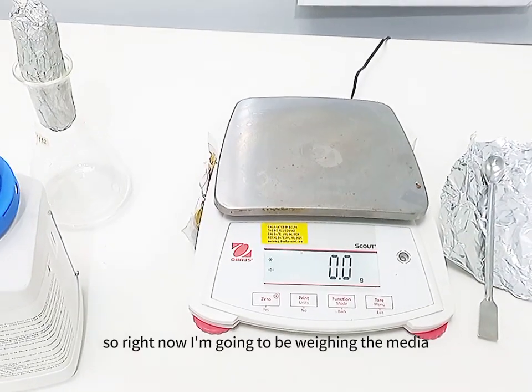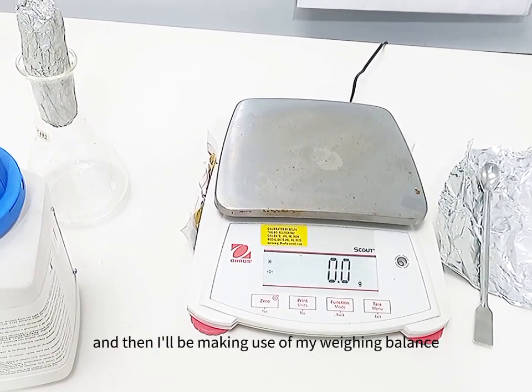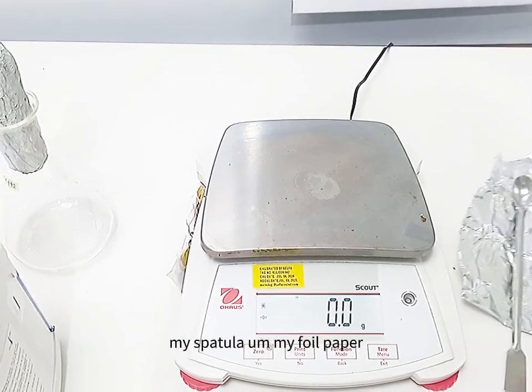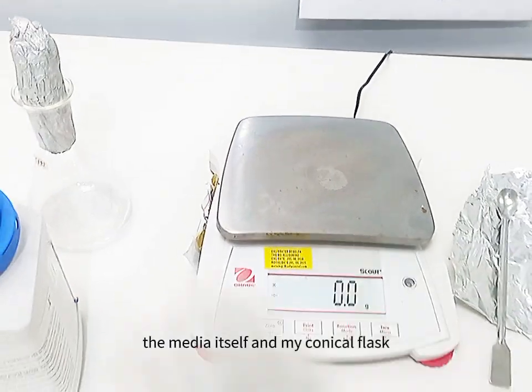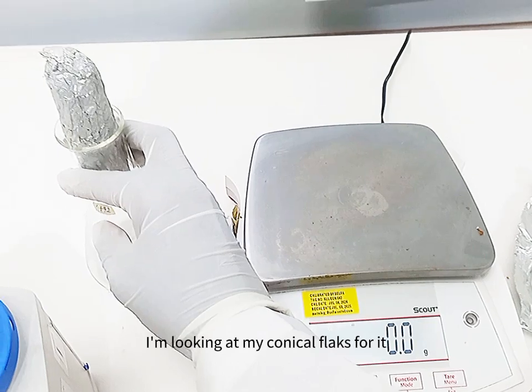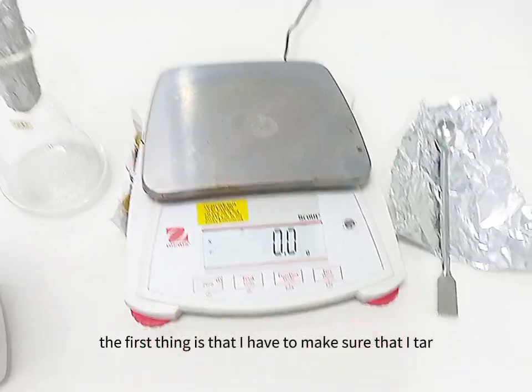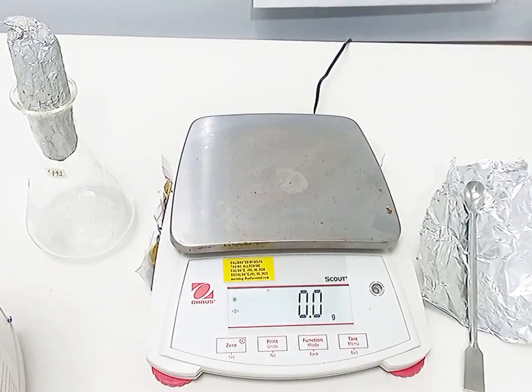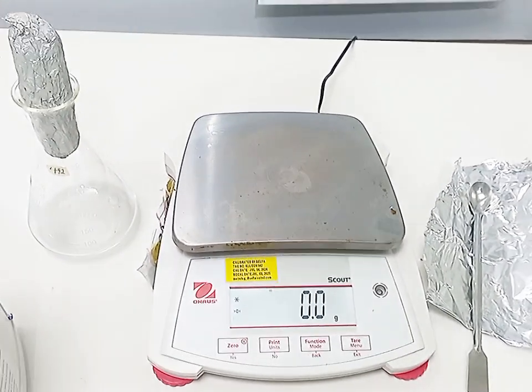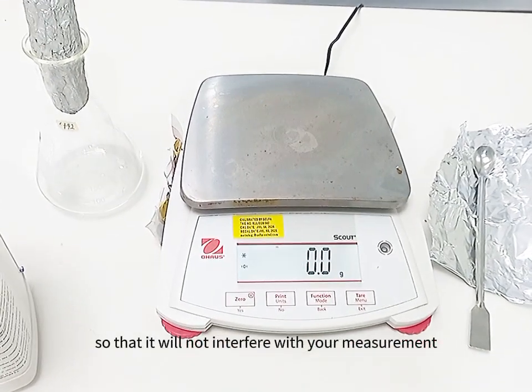So right now I'm going to be weighing the media, and I'll be making use of my weighing balance, my spatula, my foil paper, the media itself, and my conical flask. The first thing is that I have to make sure that I tare the weighing balance, and while weighing, ensure that no AC is on and all doors are closed, so that it will not interfere with your measurement.